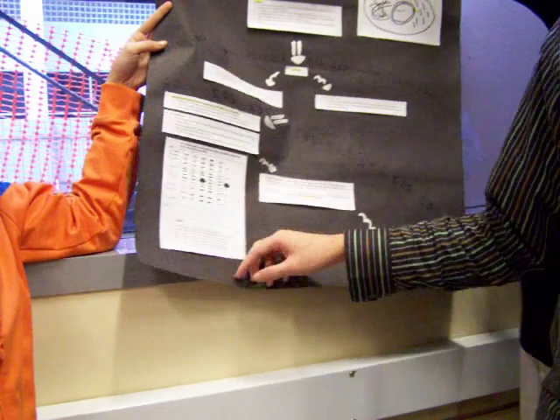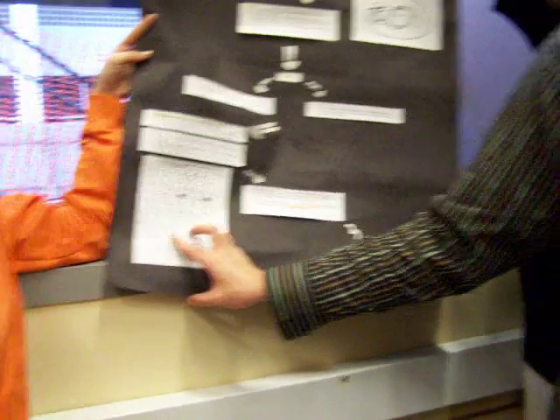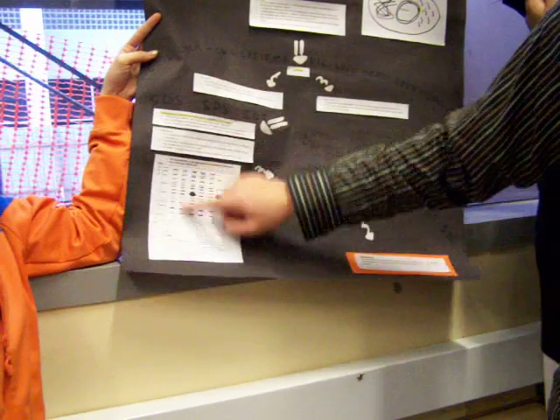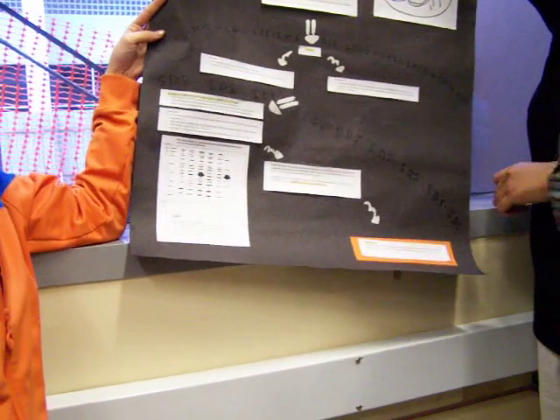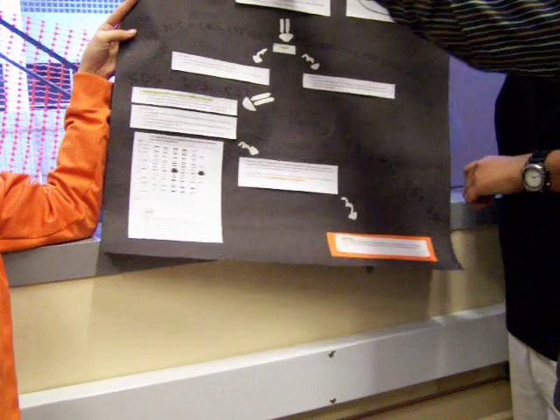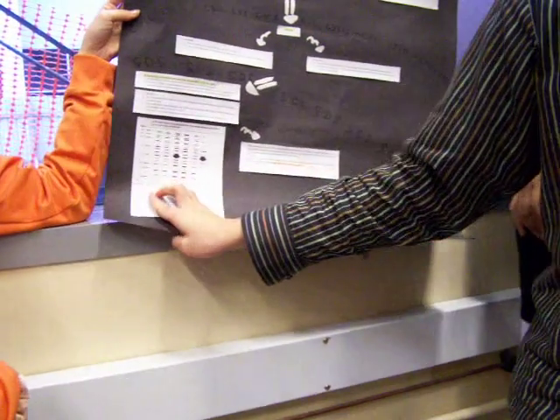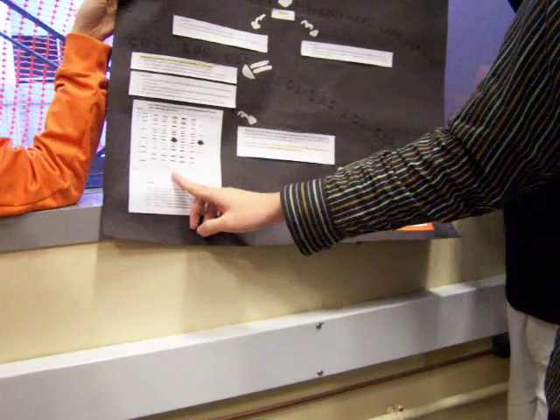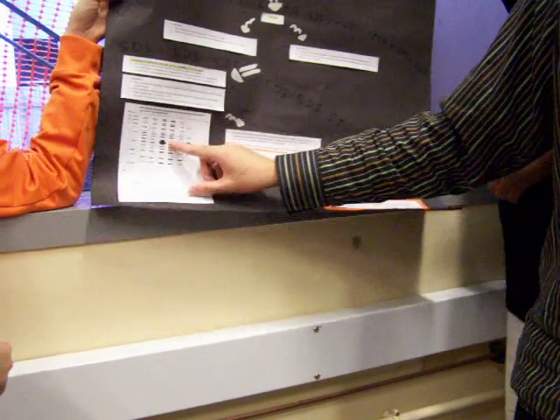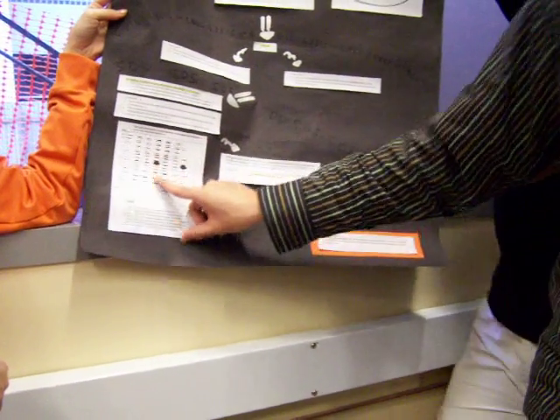And you all can see here lane 3 and lane 5, which are our control experiment. If you compare, it's very identical, just that lane 5 has a slightly thicker band because as they grow, they create more proteins. So from this, we can conclude that the IPTG is working because there's a huge thick band here.